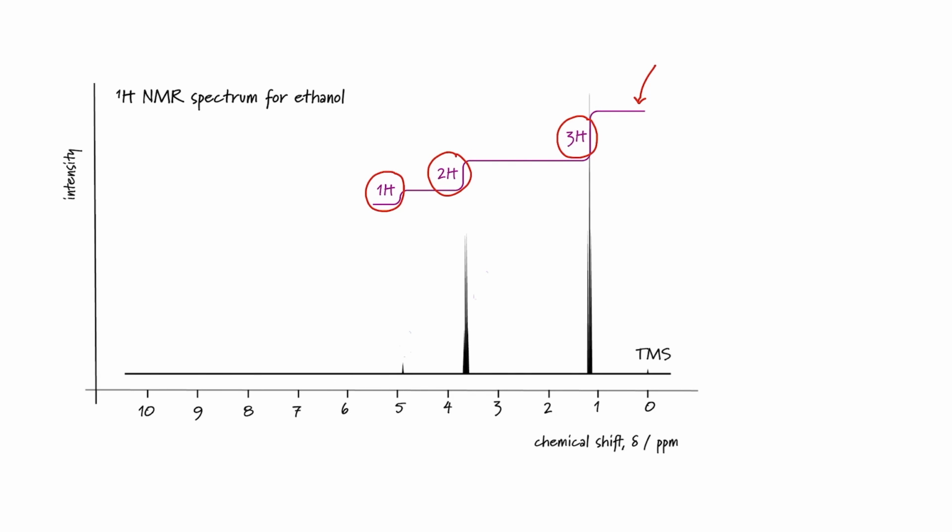The second of these videos that covers everything you need to know about proton NMR spectroscopy is going to look at the appearance of our peaks. We're going to explain why some peaks, like this one here, look like a normal peak, but other peaks look like they have been split. And then we're going to look at lots of examples, followed by some exam question practice.